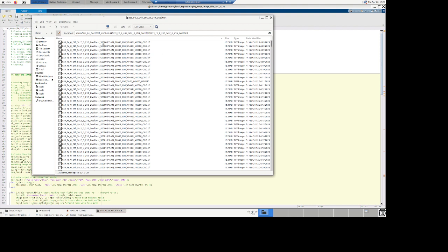So that's the name of the experiment here. And then these S are really scene or field of view. So it's field of view 0, and then 1, and 2, and 3. So it's different fields that we take, and fields are pretty large typically. And you can see here that 4 channels were taken. AF48, that's typically green.